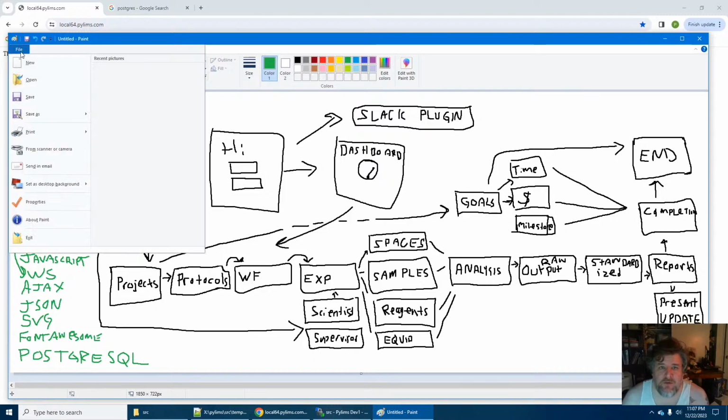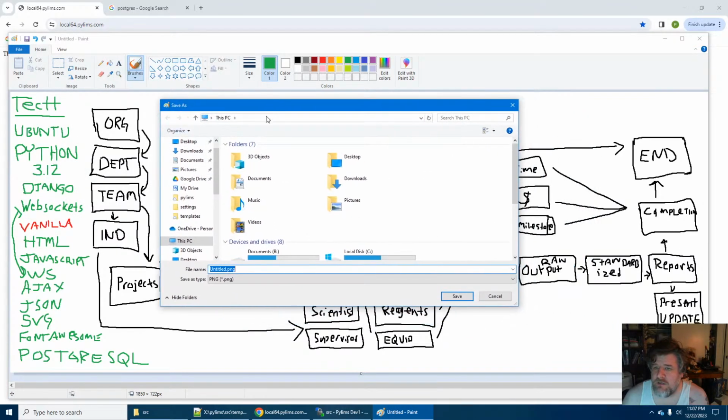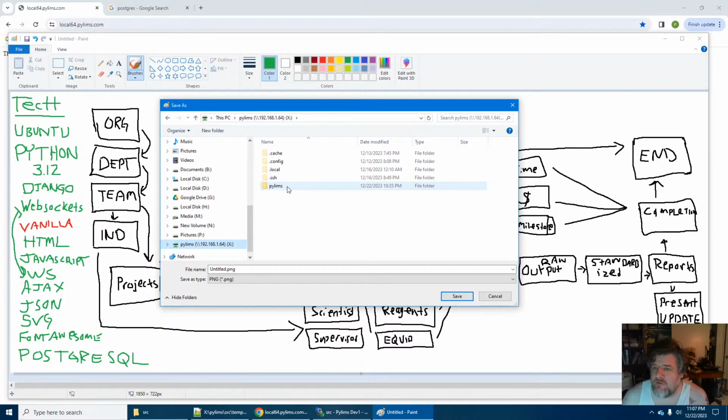Alright. File, save as PNG. Save it to others.